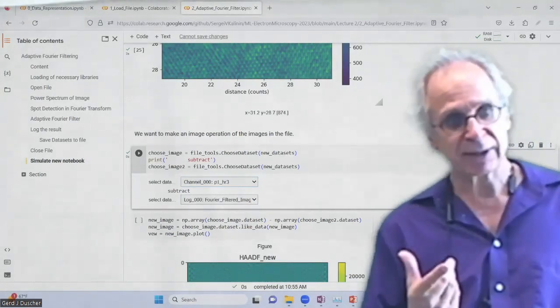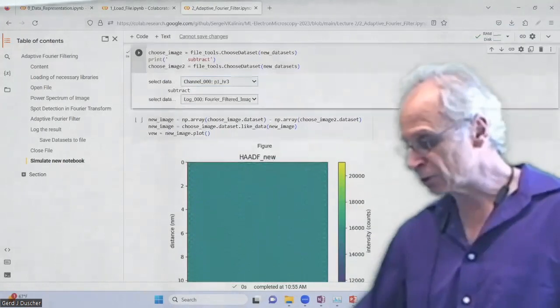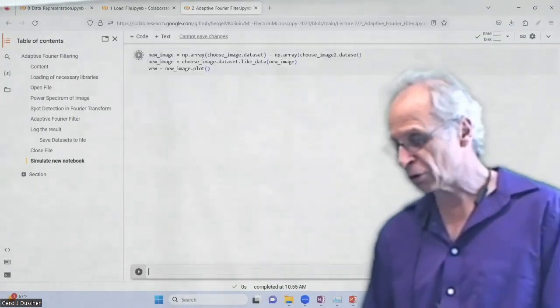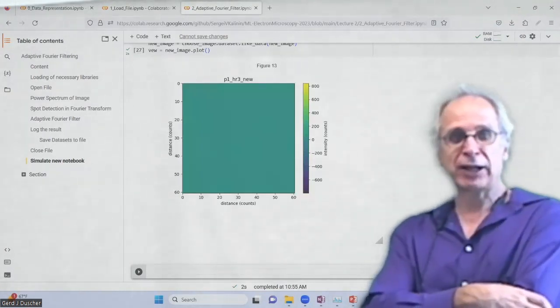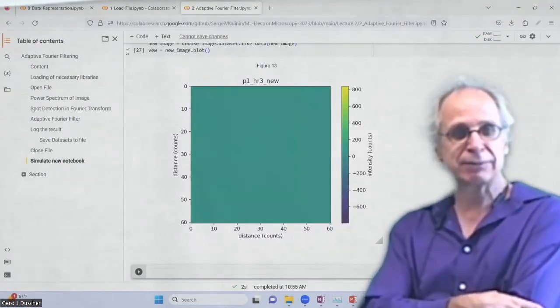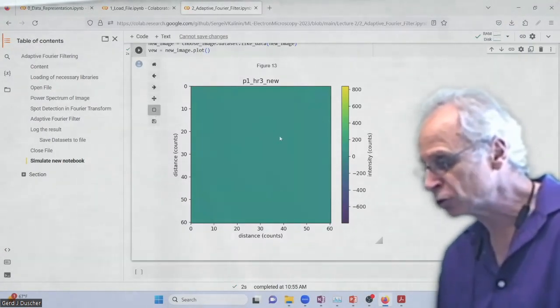And that is a test in any image analysis you should do, right? Just to see, what did you throw away? What did we throw away? Well, at this level, it doesn't look like we did throw anything away. We have to zoom in quite a bit.